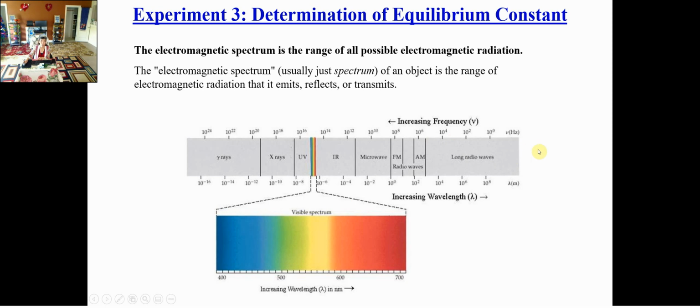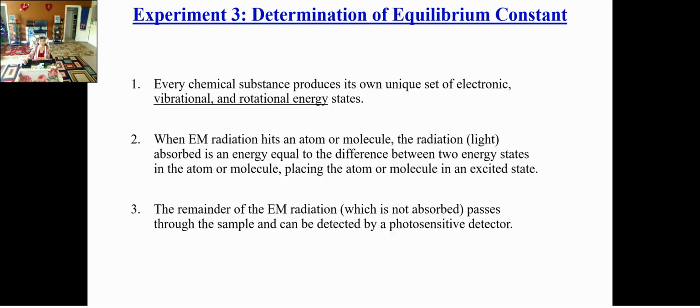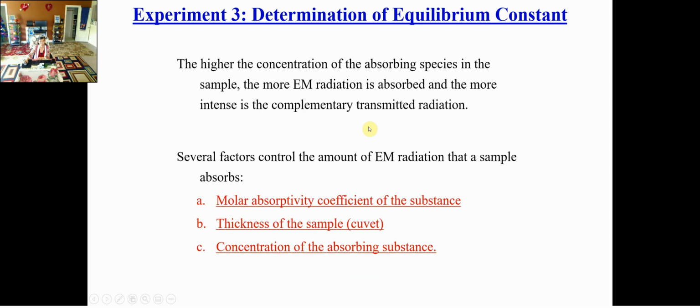You can see from radio frequency all the way to the microwave, infrared, UV light, ultraviolet, X-ray and gamma ray. You can see our visible light is a very small portion, 380 all the way to 800 nanometers. And about the characterization, in this case you are going to use the absorbance A equals small a times b times c.